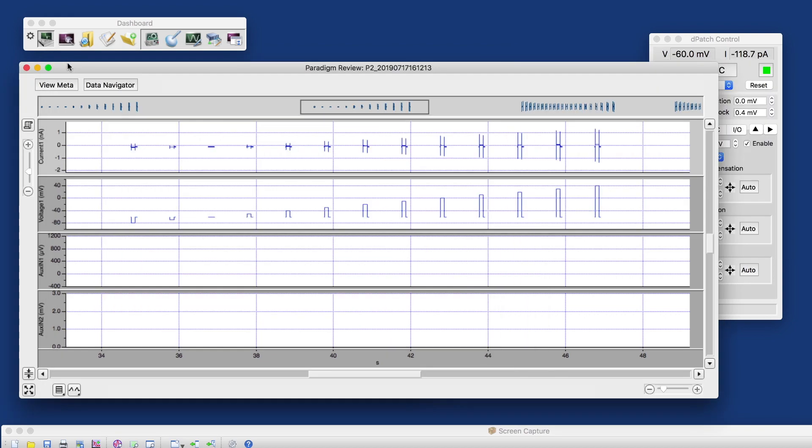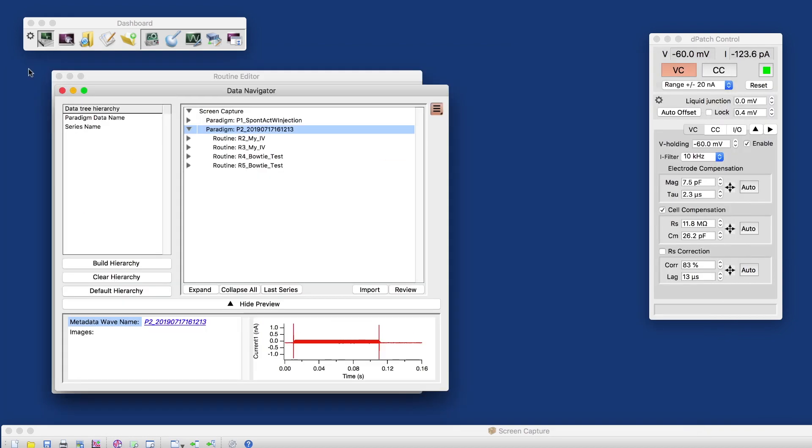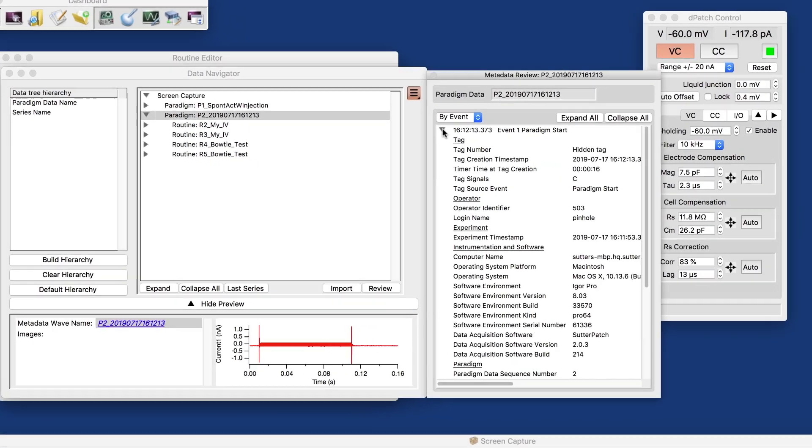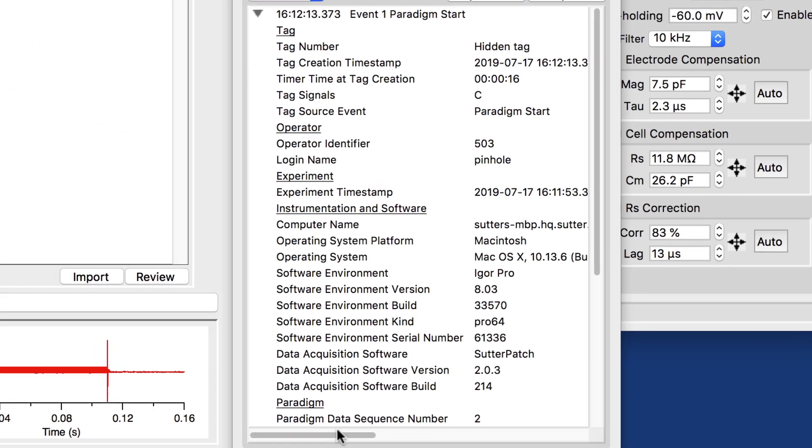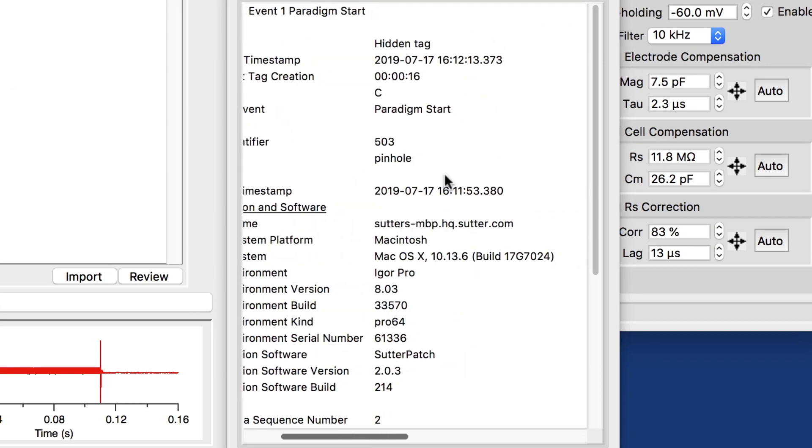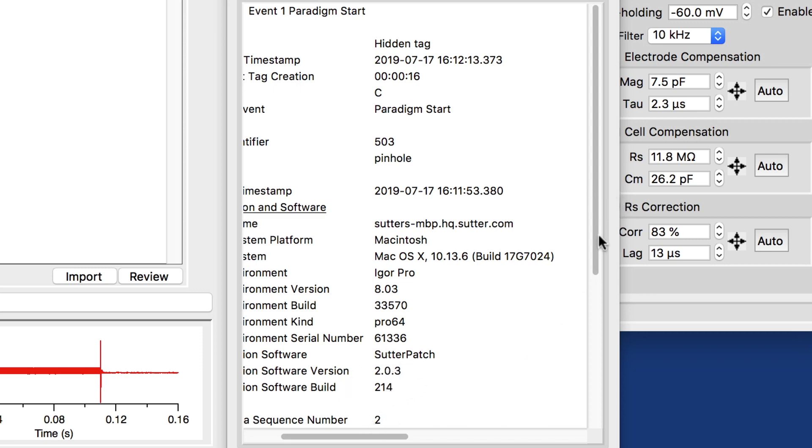What we can also look at is the metadata. Let's go to the data navigator to do that. We have a bunch of metadata associated with this paradigm here. We started the paradigm, and here we have things like we recorded this on a Mac, which has a name, and with Sutterpatch version 2.0.3, build 214, a lot of these parameters.